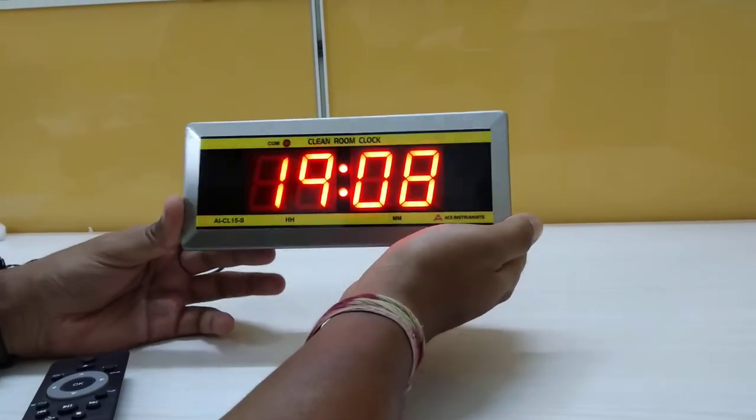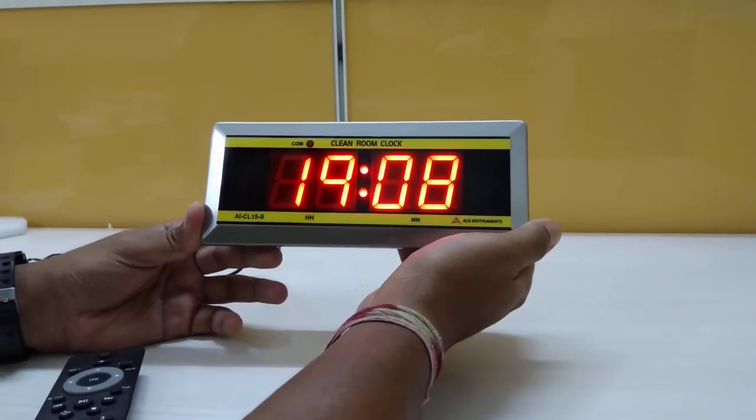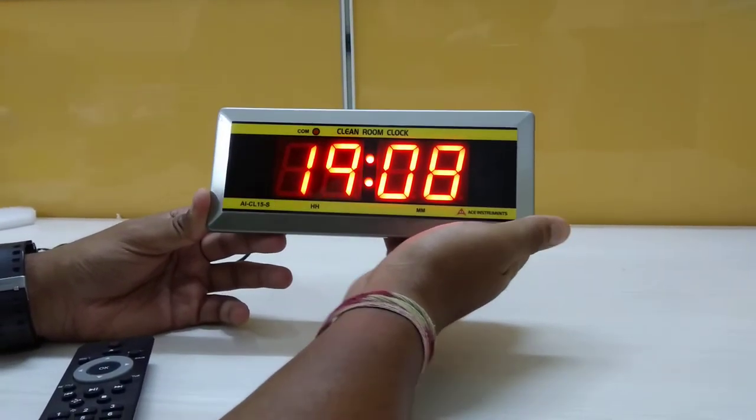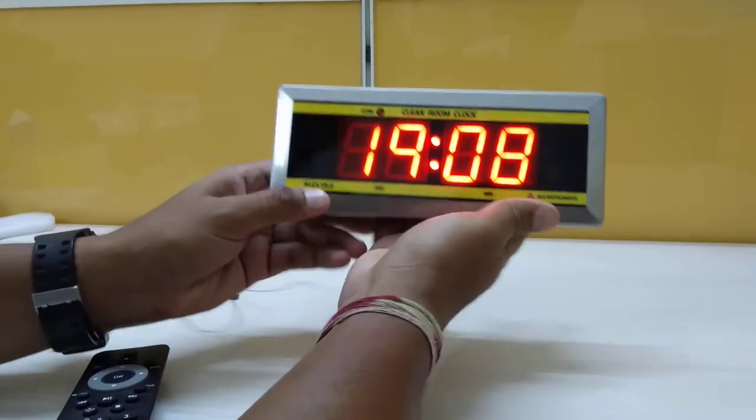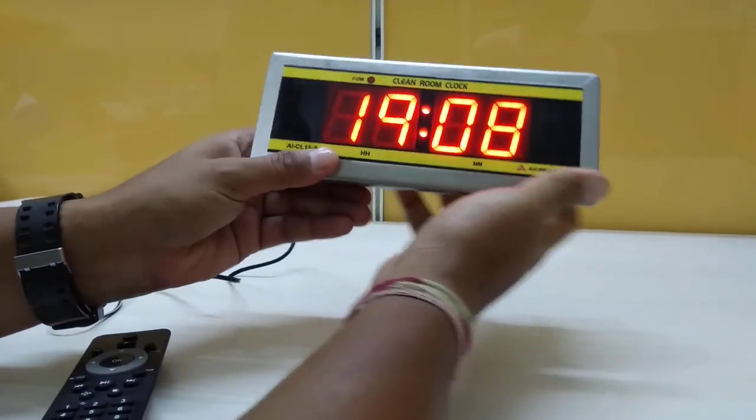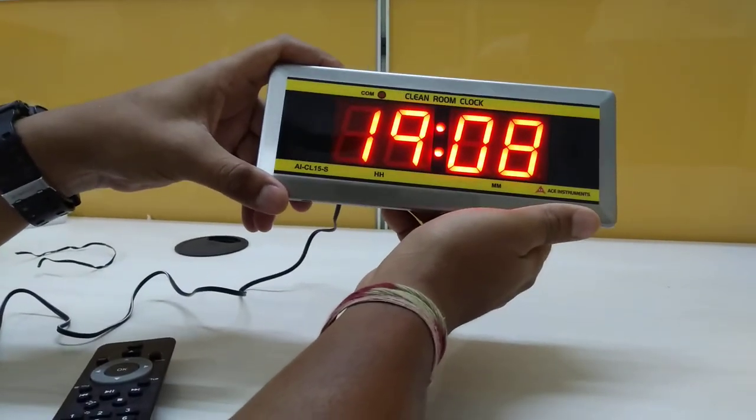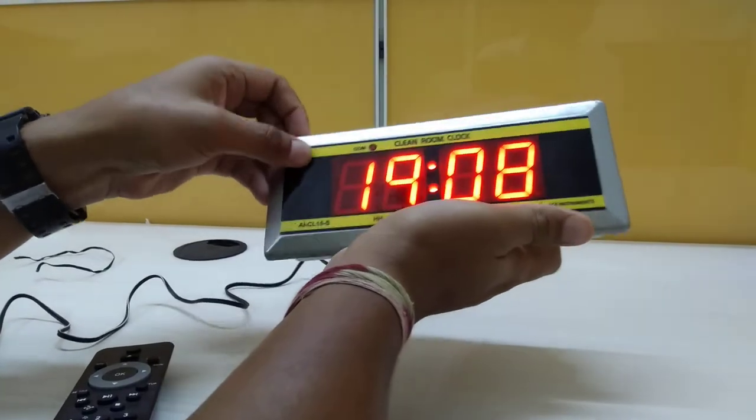Hi, I am going to walk you through this clean room clock manufactured by Ace Instruments. The model number for this is AICL 15S. This clock is particularly used in clean rooms and the finish is made perfectly suitable for the clean room environment.